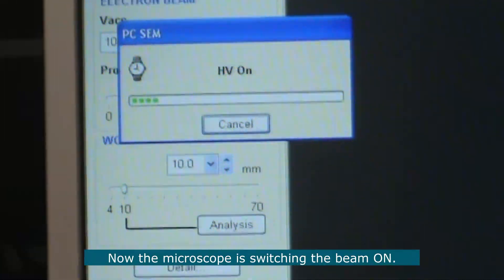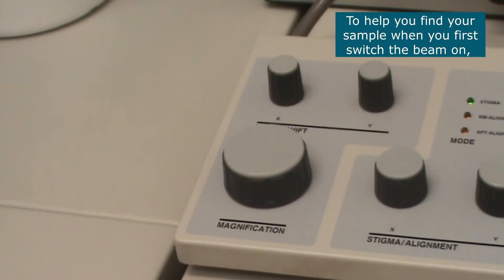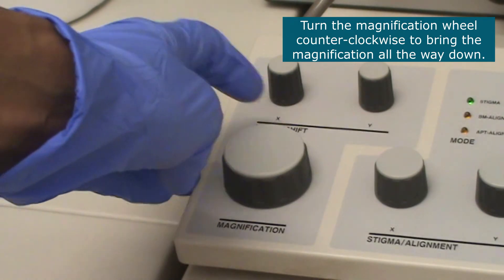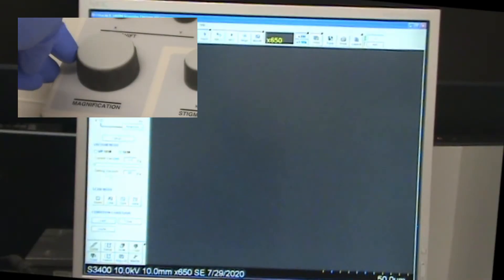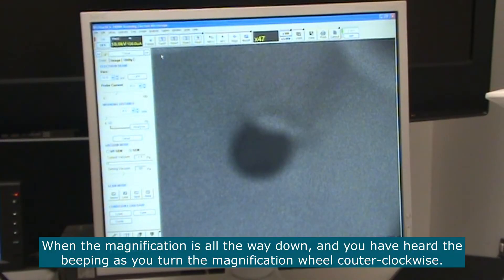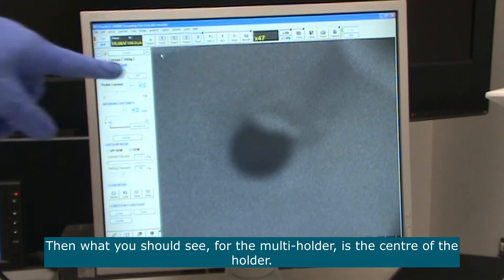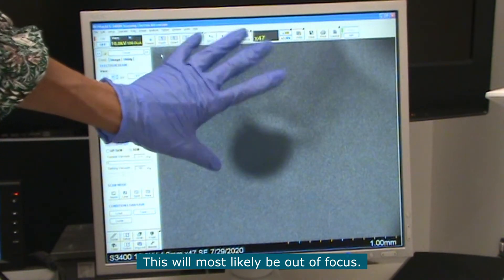The microscope is now switching the HV on. To help you find your sample when you first switch the accelerating voltage on, go to the magnification wheel and turn it counter-clockwise to bring the magnification all the way down. When the magnification is all the way down, you should see the center of the holder, which will most likely be a bit out of focus.